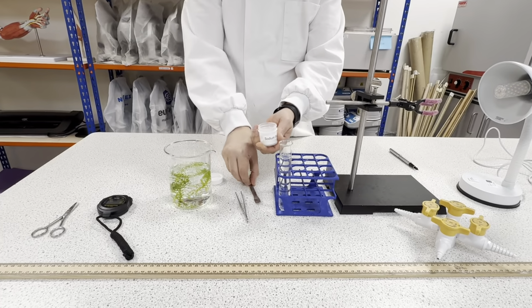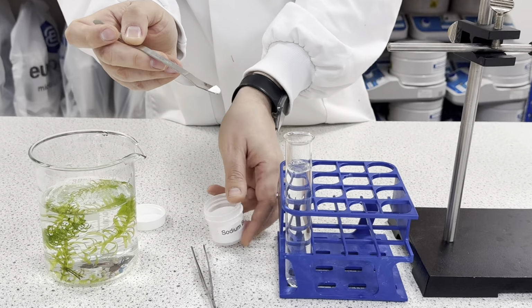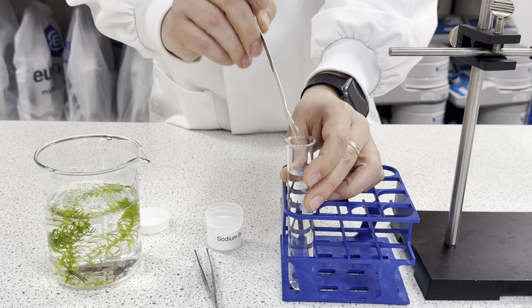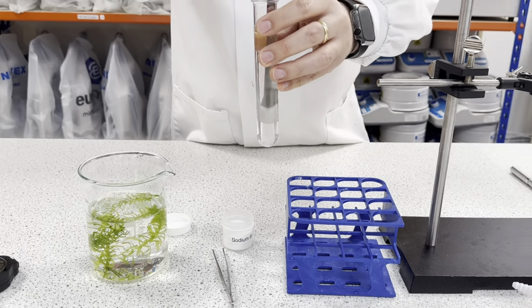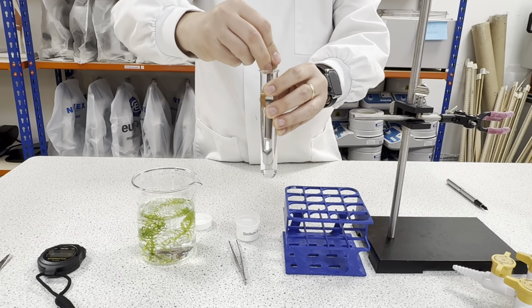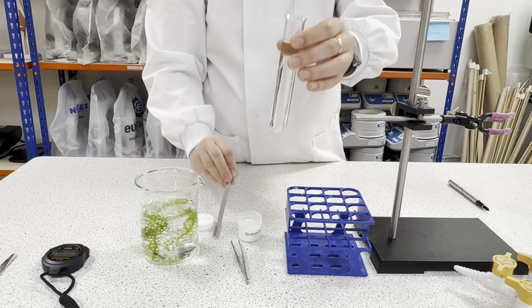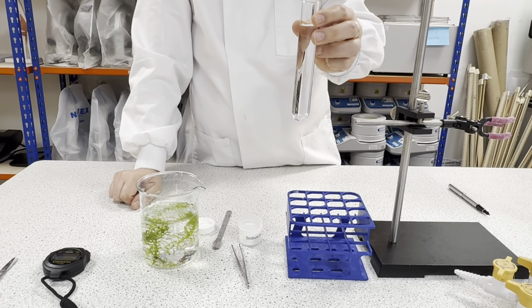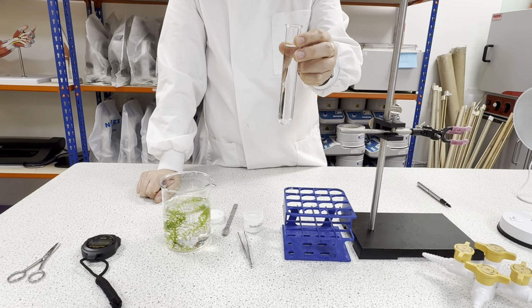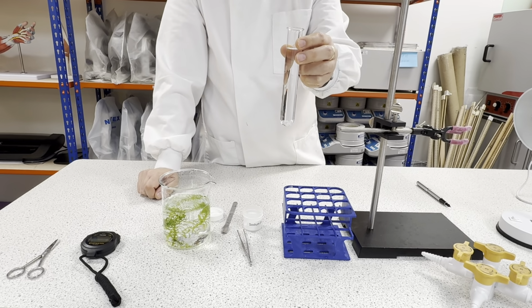So I will take a small amount of sodium bicarbonate and I'm gonna place it here. Why am I adding just a small amount? I just need to increase the level of CO2, but not change how clear my water is. If I add too much sodium bicarbonate, the water will be cloudy and the photosynthesis will be affected.